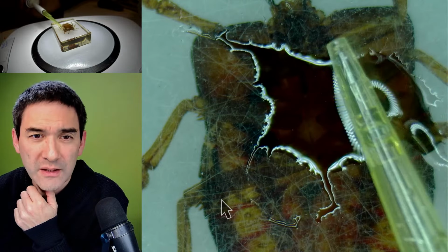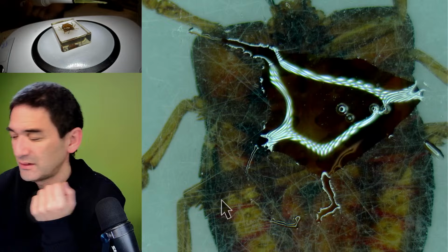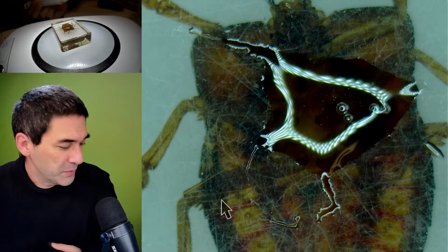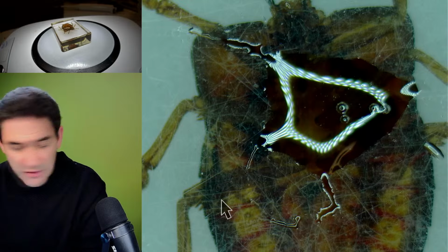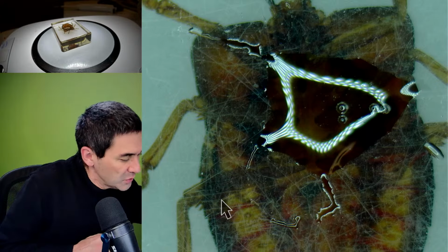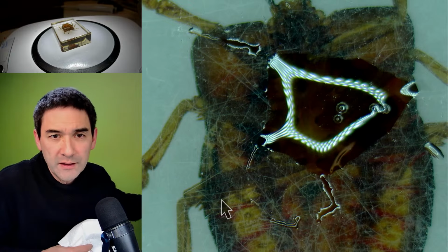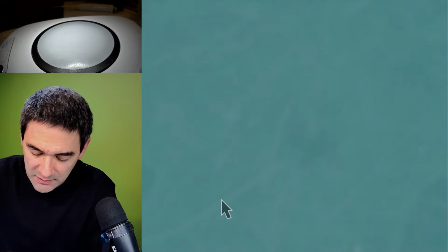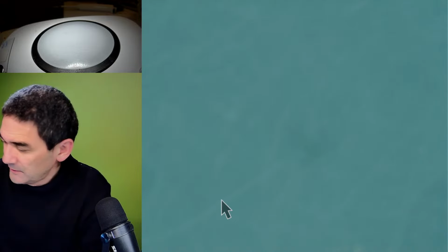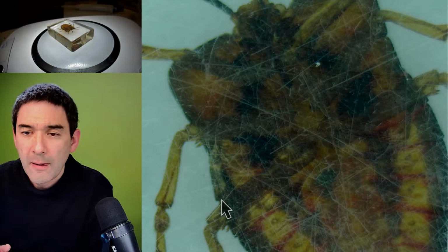I'd probably have to get some vegetable oil from the kitchen and try that. Maybe that's a possibility to remove the scratches. But glycerin is not a good liquid for removing the scratches. But yeah, you get the idea. I'm going to wipe it again. So, clean again.